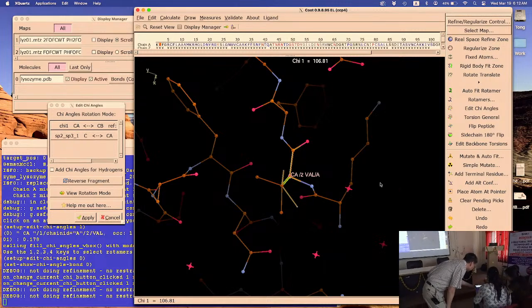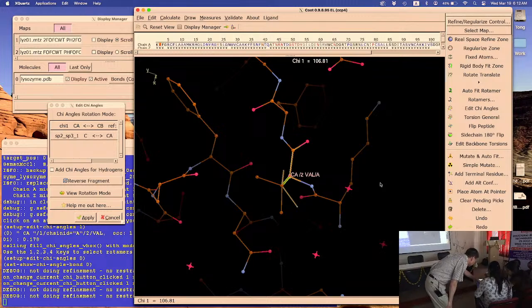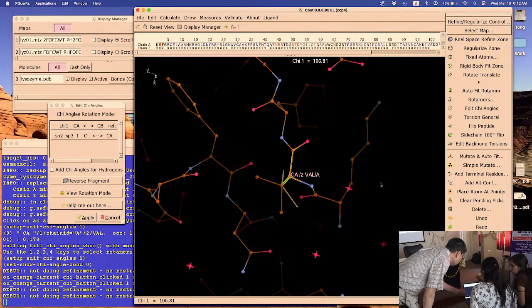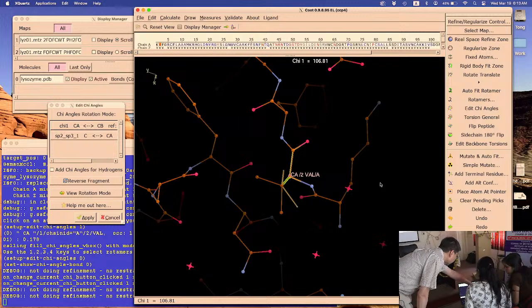Yeah, select that, maybe click it twice. And then go back here, to the graphics window. Click somewhere in the graph, but don't close it. Go back to the graphics window. You can't go out of this? Yeah, click on that. You have to drag this out of the way a little bit, to the left.